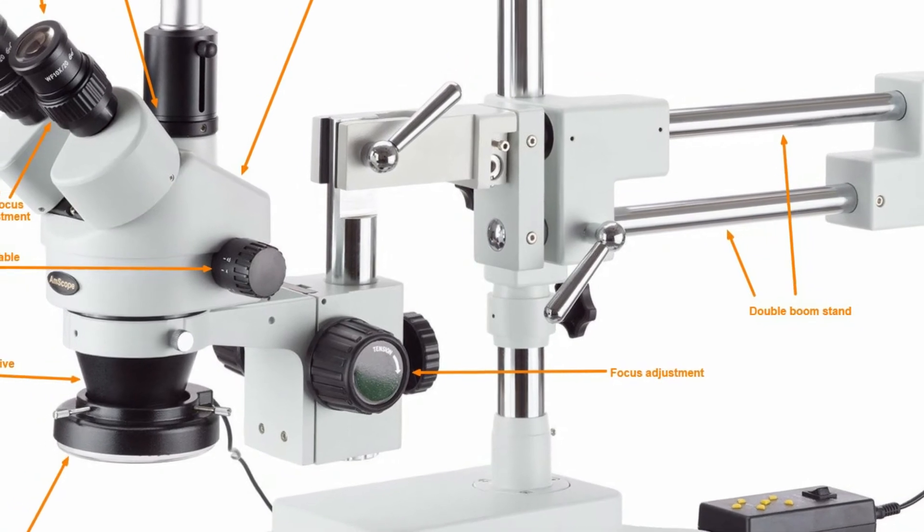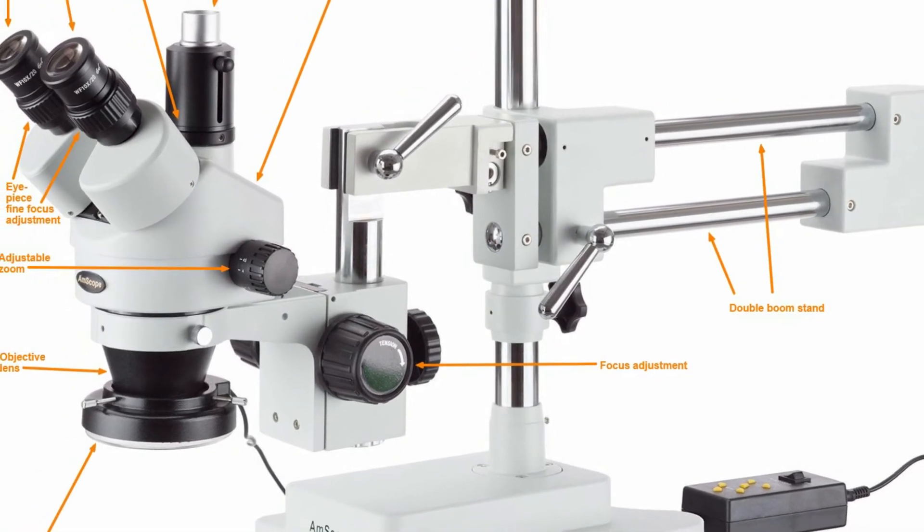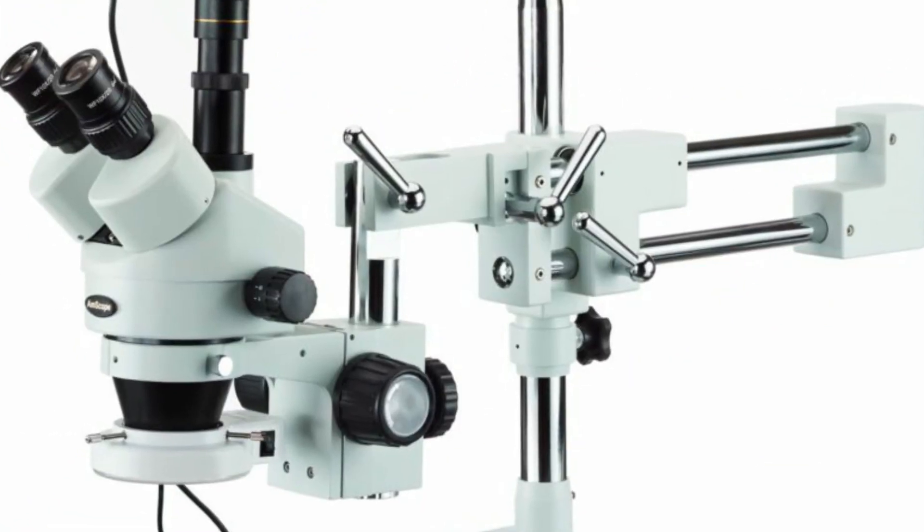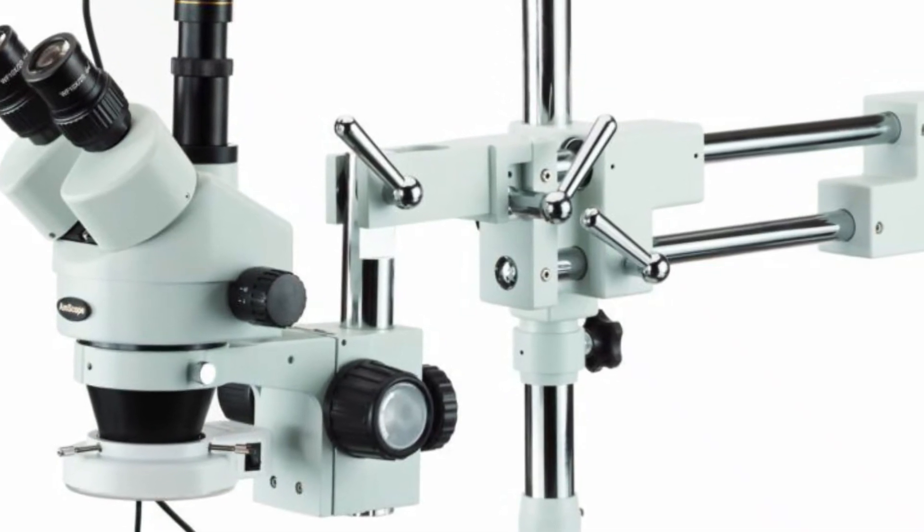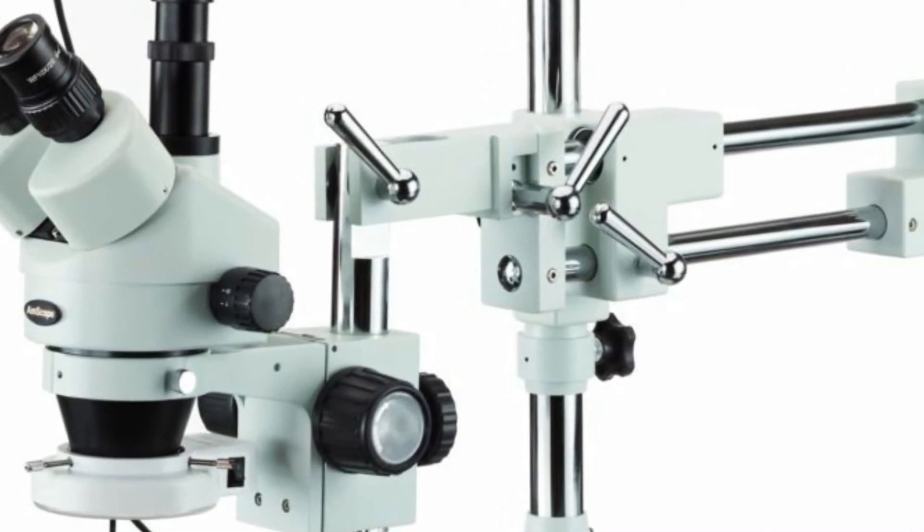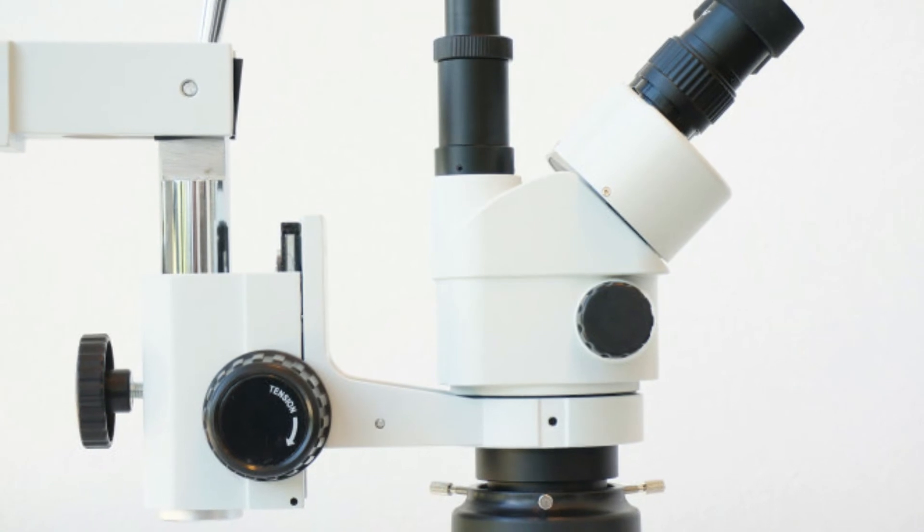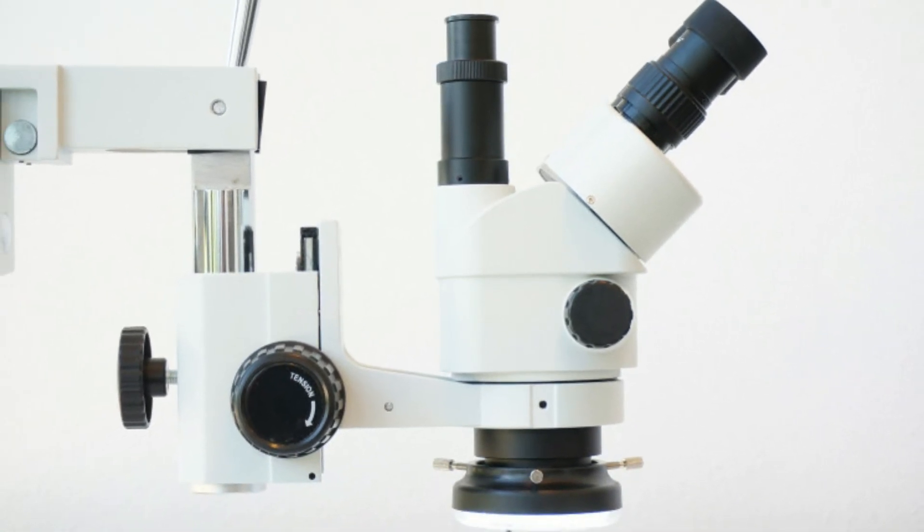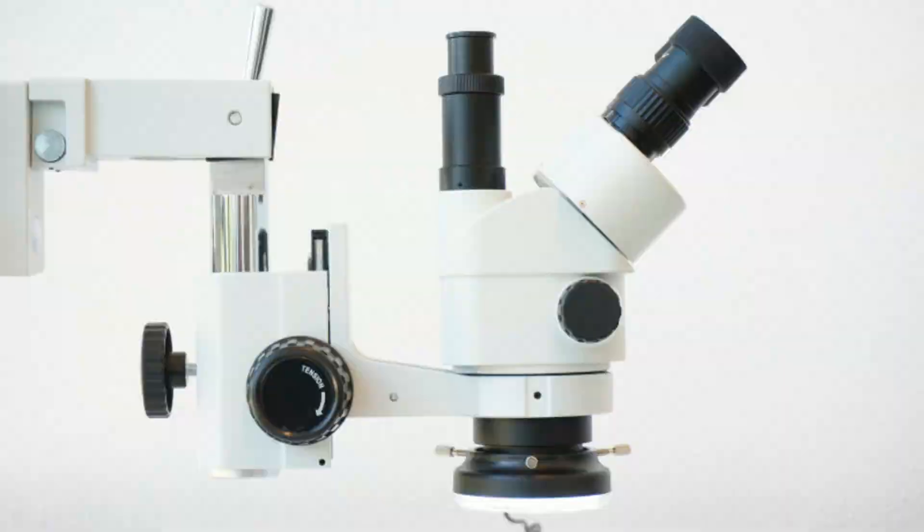Rotating interpupillary adjusters simplify the process of aligning the eyepieces for each user. Simul-focal optics allow the trinocular port to be used simultaneously with both eyepieces, meaning a camera can stream live images while you continue to work with full stereoscopic vision.